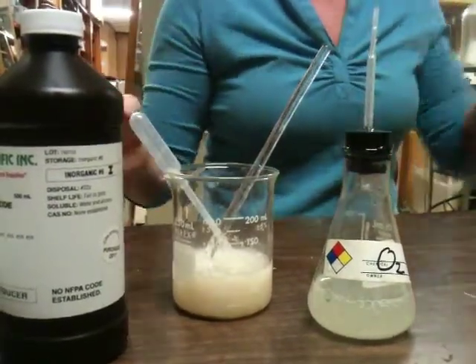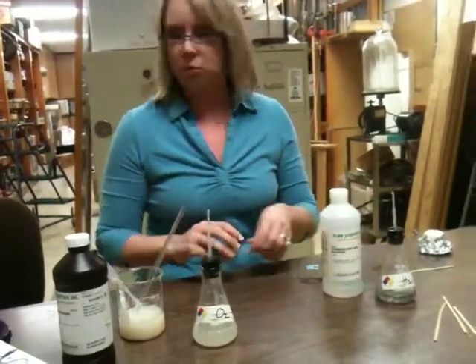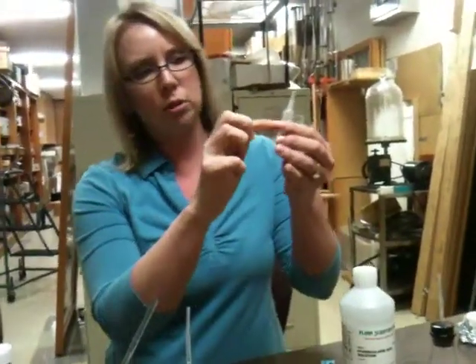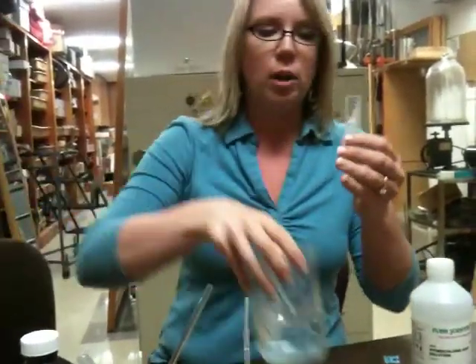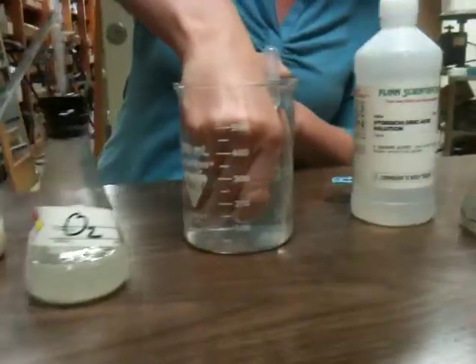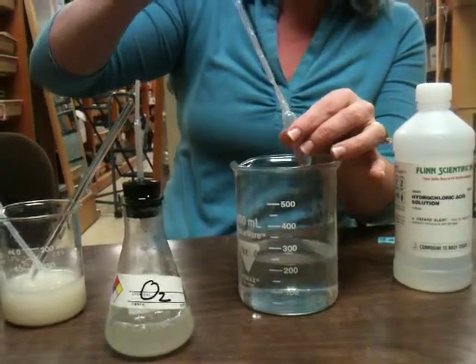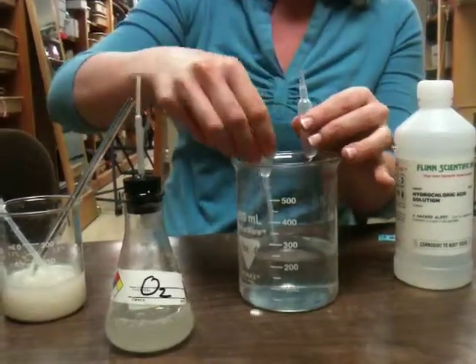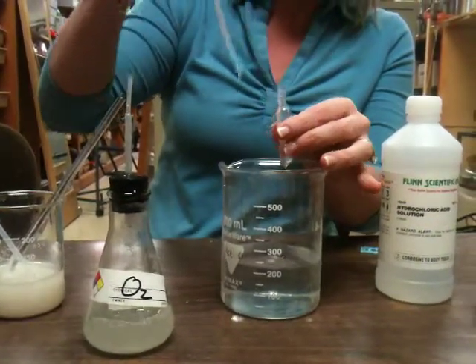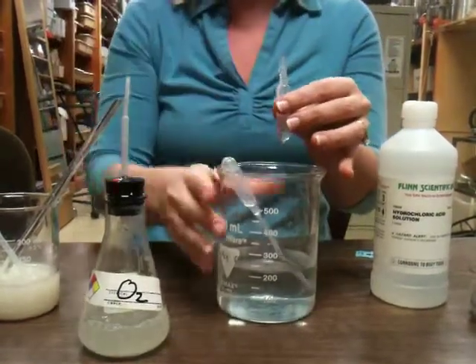Alright, so I'm going to now demonstrate how to collect the gas for you. You do always want to collect oxygen first, so that's what we'll do first. You've got your bulb that you've cut off, and you have your lines on it because you've already calibrated it, and you want it full of water. So you can just put it down inside of a beaker. You actually probably want more water than this. It'll make your life a little easier. But you can use a second pipette to squirt some more in. Get just a little bit more. Alright, so it's all the way to the top.